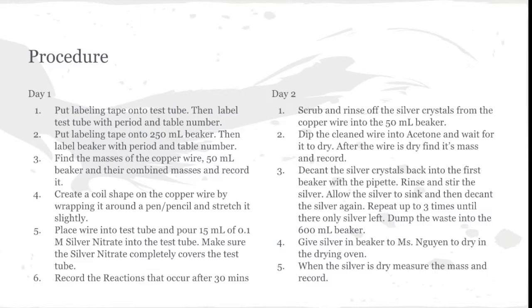Day 2. Clean the silver crystals off the copper wire. Dip the clean wire into acetone and wait for it to dry. After the wire is dry, find the mass and record.